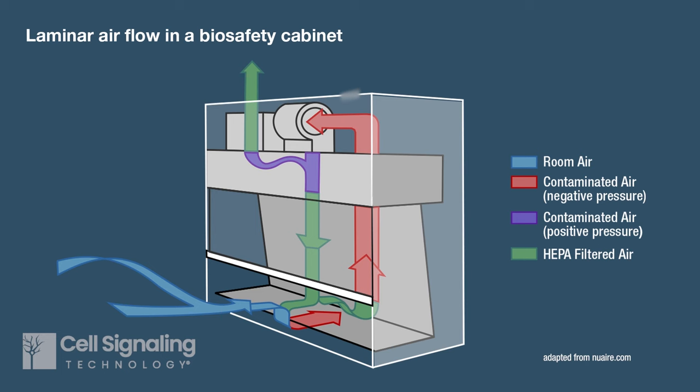The biosafety cabinet, also known as cell culture hood or tissue culture hood, uses laminar airflow as a barrier to reduce contamination by airborne particles in the room.